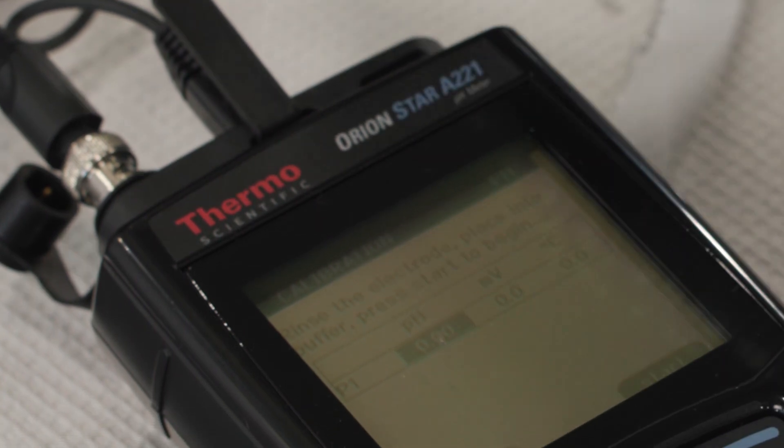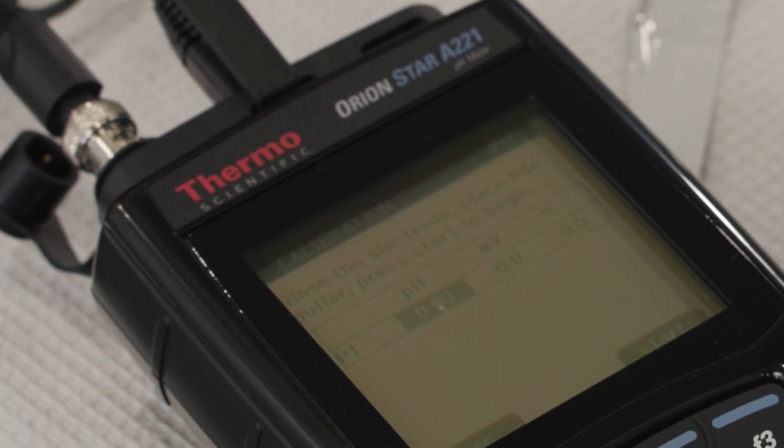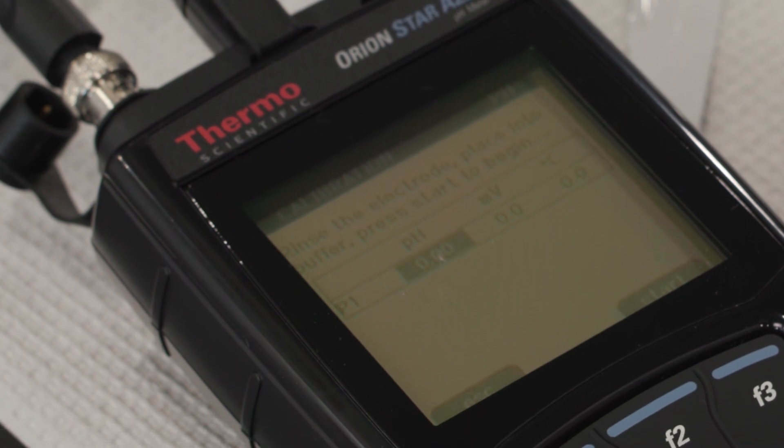Step-by-step instructions guide users through the calibration steps and are helpful for users with varying levels of technical expertise.